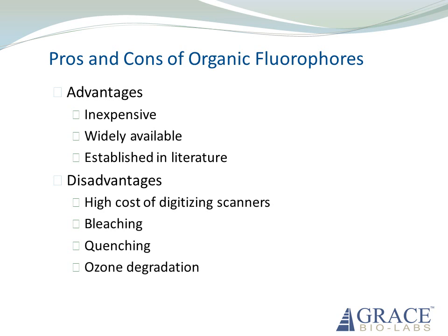Second, organic fluorophores have a decay mechanism known as bleaching. Fluorophores that are repeatedly scanned with a high-power laser undergo a significant reduction in brightness because the double bonds are being broken by the intense radiation and therefore cannot contribute to fluorescence. Third, as we've seen earlier, there is an overlap of the excitation band with the emission band. Light that is emitted as fluorescence can be reabsorbed by the dye, leading to an upper limit on the brightness of the dye. This saturating effect is known as quenching and limits the ultimate sensitivity of the assay.